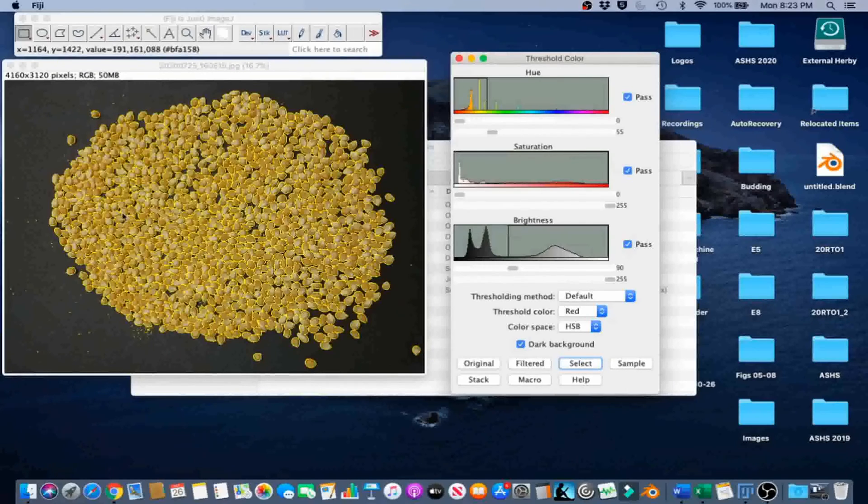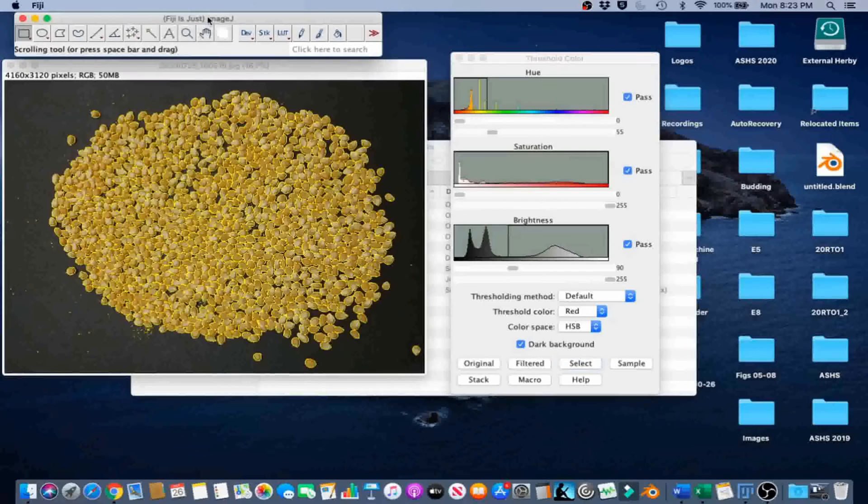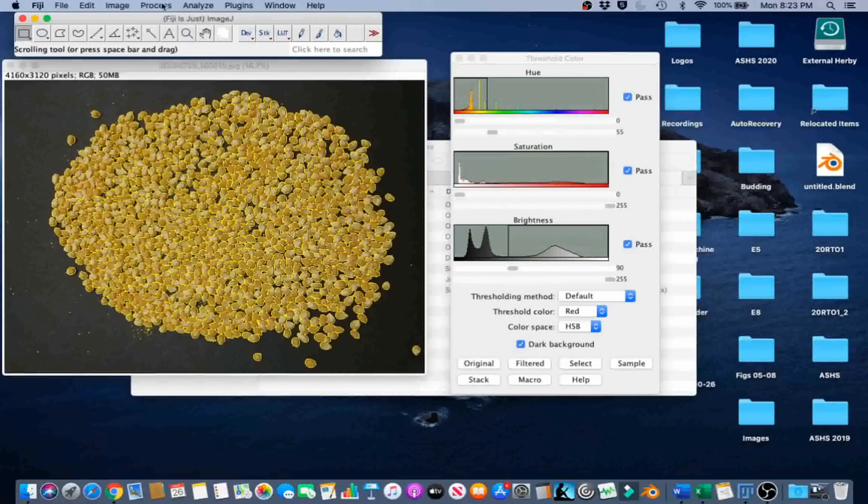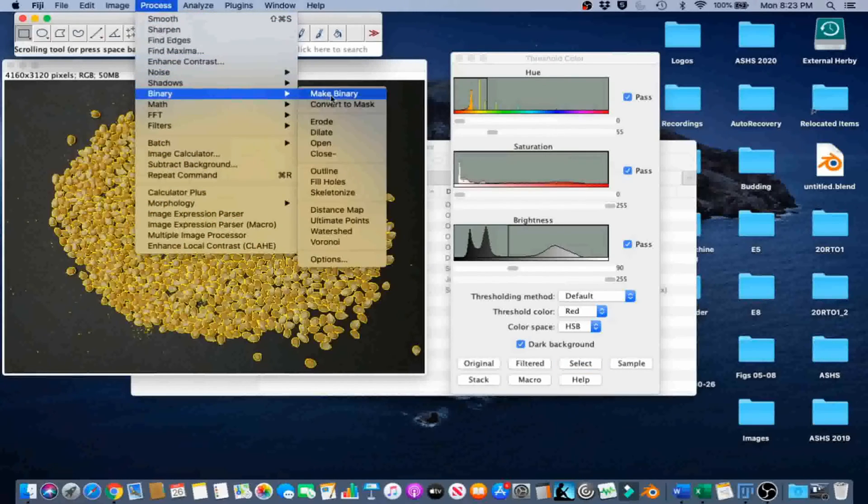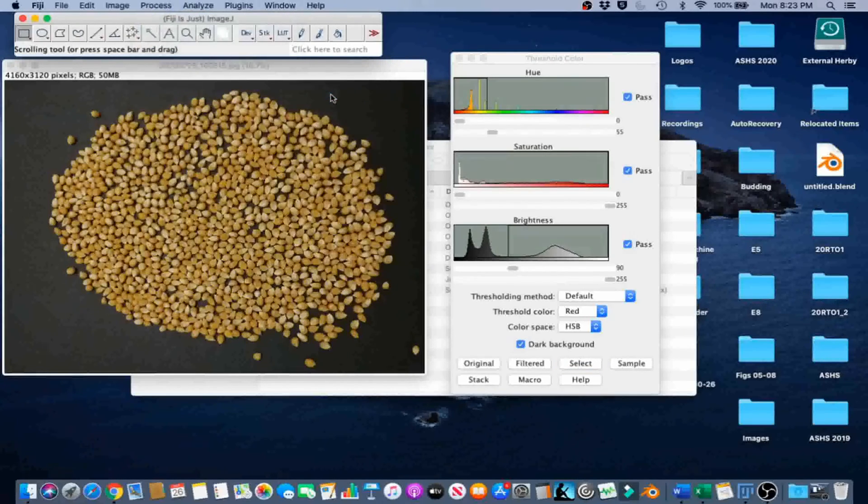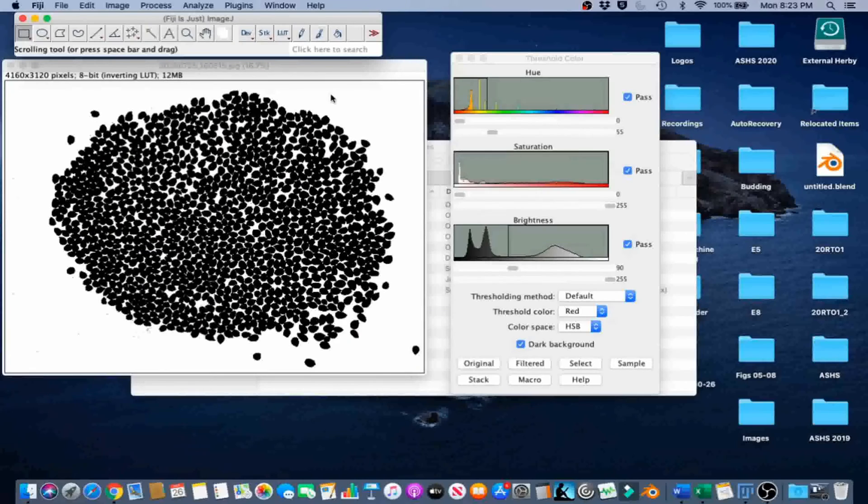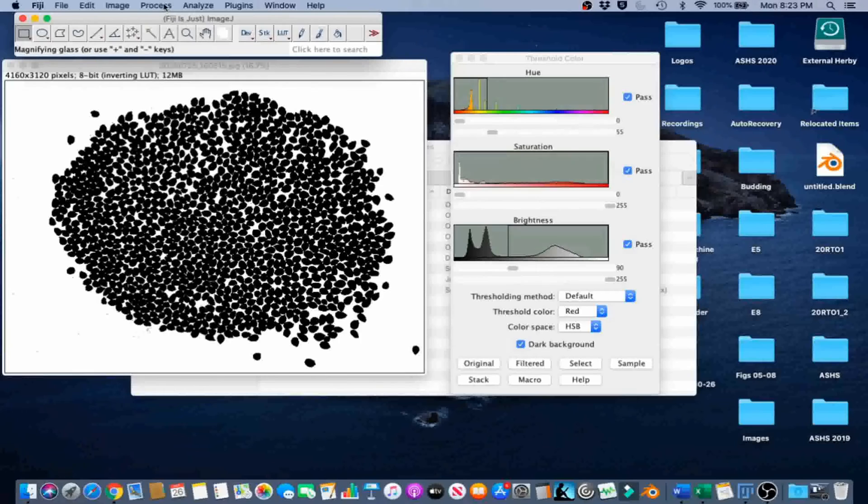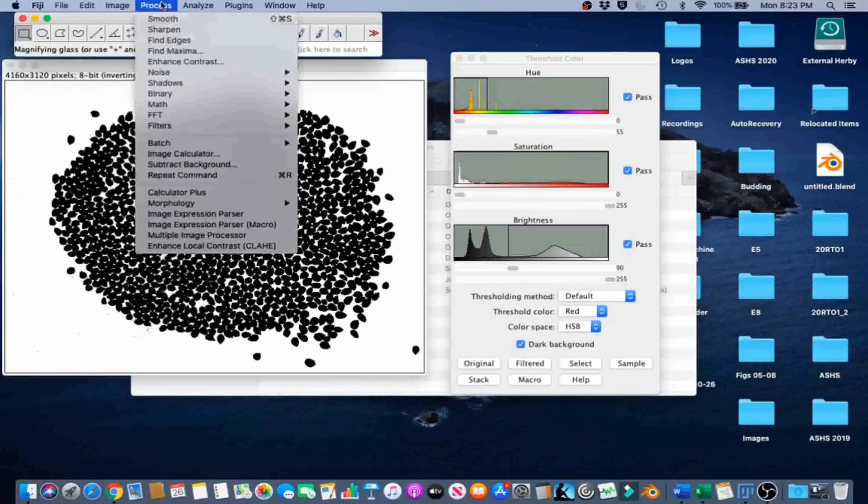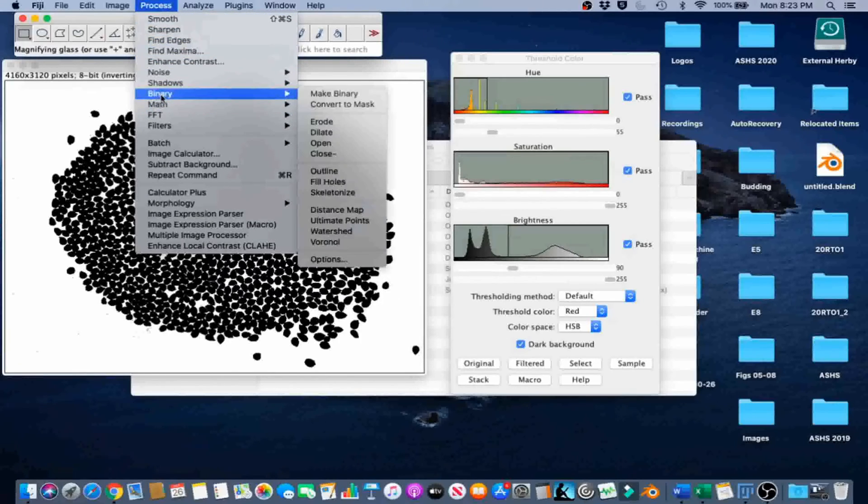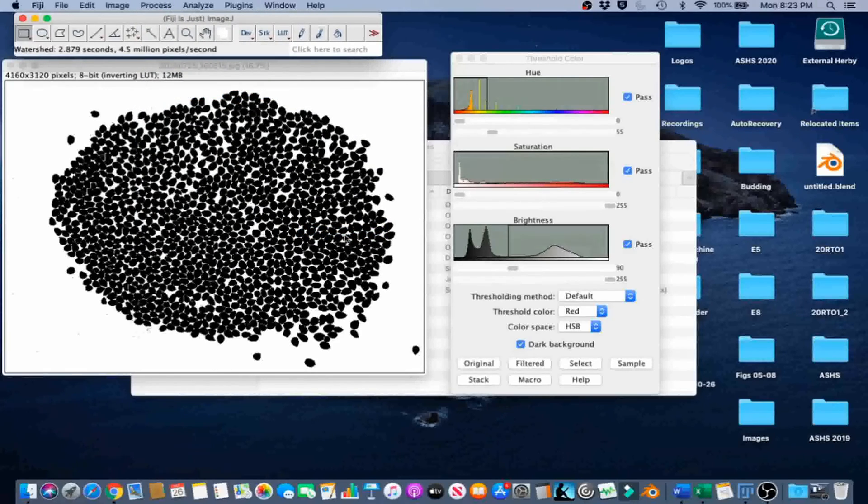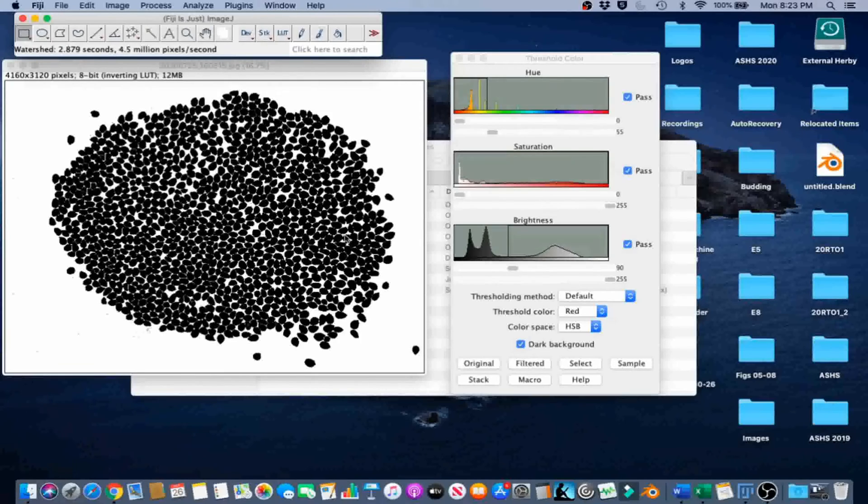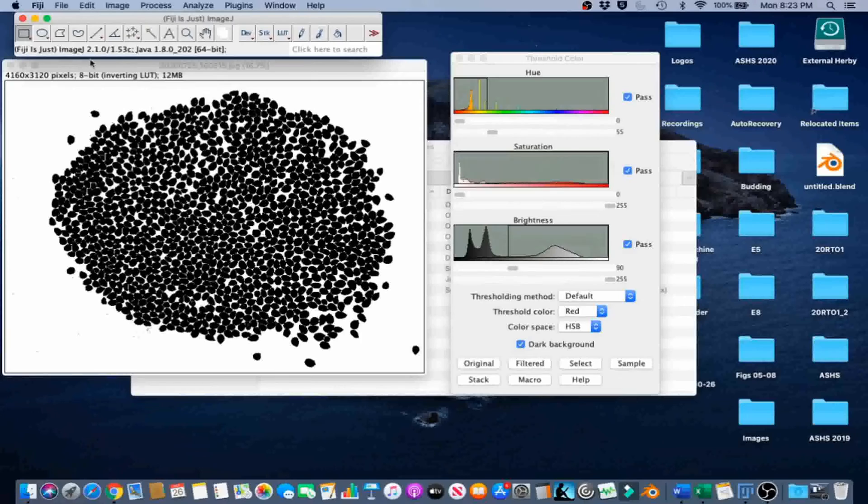Next, go to Process Binary Make Binary. Convert the color image to a binary image. Go to Process Binary Watershed to add a single pixel line between all of the seeds. Or in this case, all the pixel clusters in general.